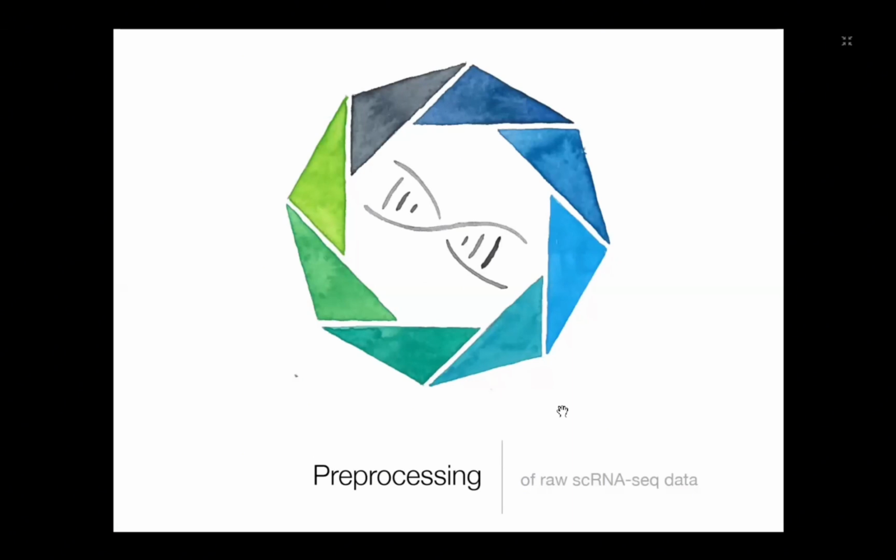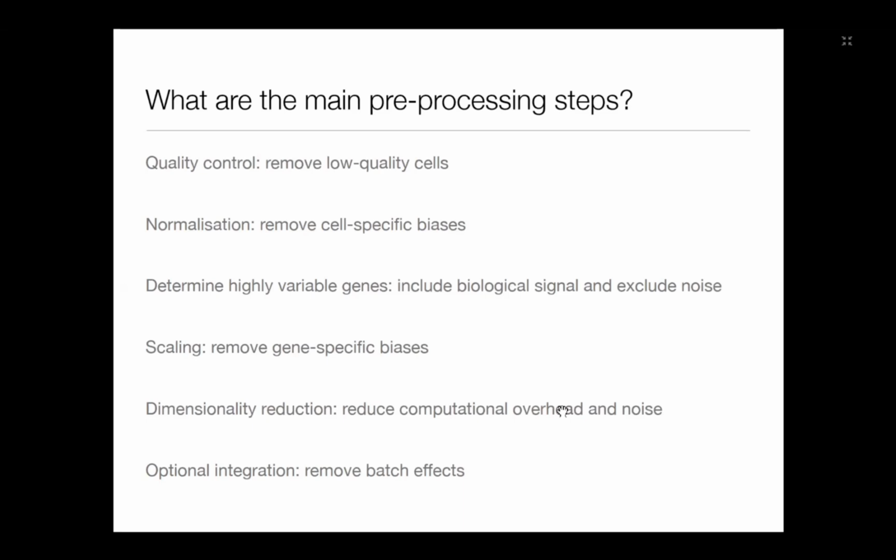Now we actually have a gene counts table and we can get started. That means we start with preprocessing the data. If you ask me or you ask another bioinformatician, the exact steps will probably differ a bit, because everybody has his way to work with data. But I believe that these are the main steps that we all have to do.